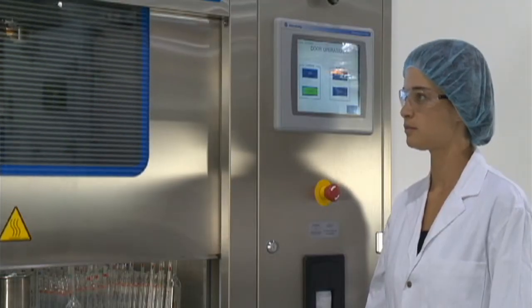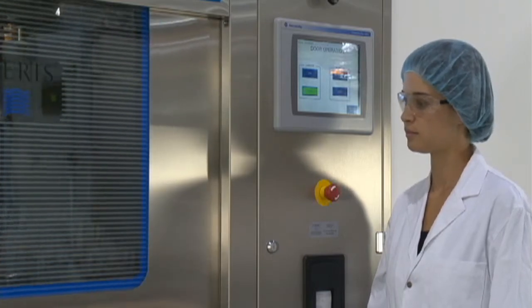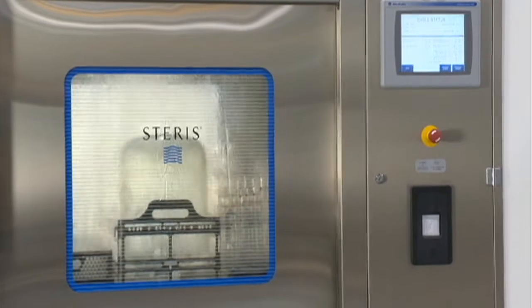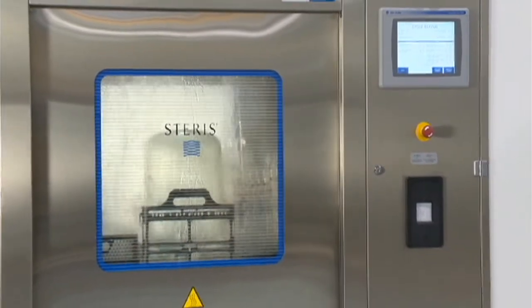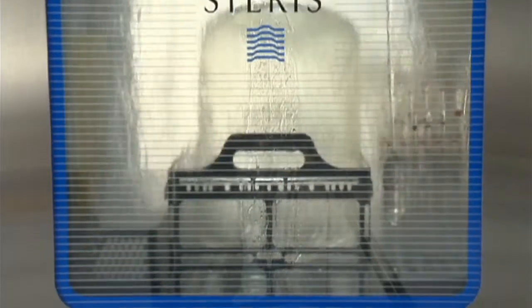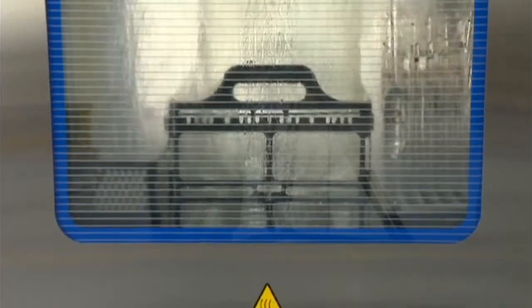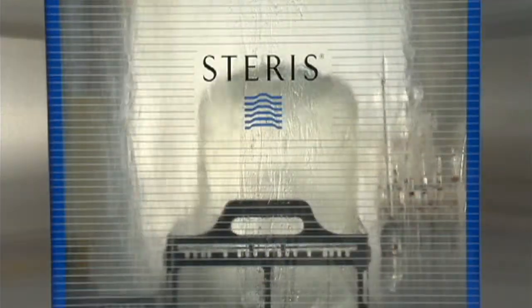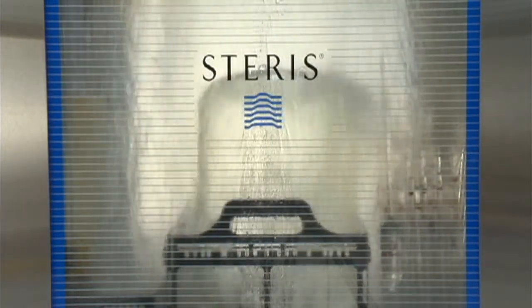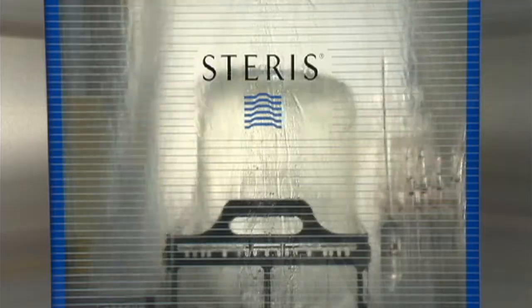Lowering your utility consumption is eco-friendly and can lower your operational costs. The 380PG washer uses 12% less water than the previous high-performance model. It can also use recirculated chilled water to cool down the effluent during each heated cycle phase. A unique non-recirculated or single-pass rinsing system significantly reduces consumption of purified water.